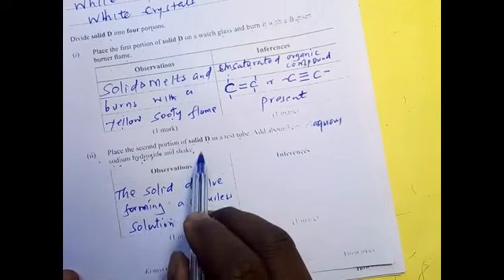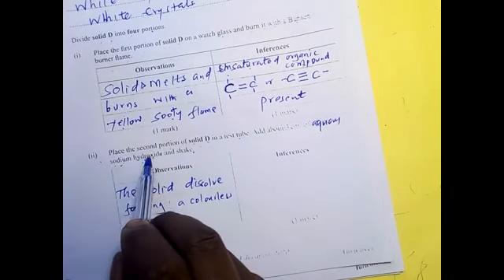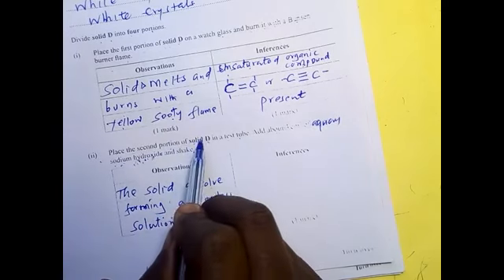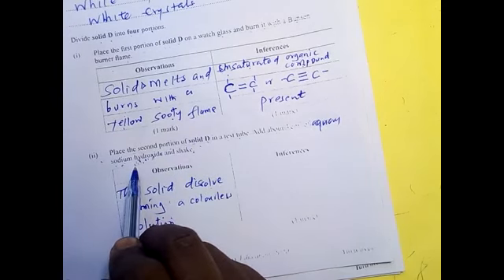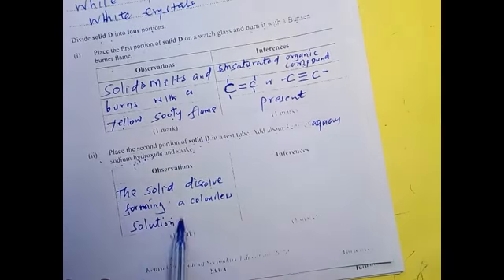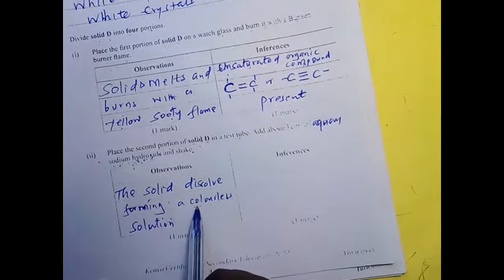Now remember, a solid is dissolving in sodium hydroxide, which is a base. Then that definitely tells you that this solid was acidic, right? An acid plus a base will give you a colorless solution, a neutralization reaction.